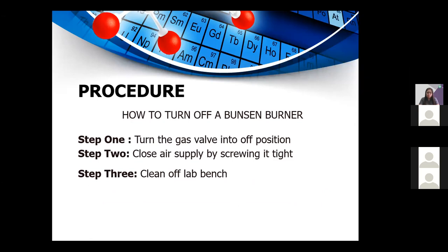How to turn off a Bunsen burner: Step one, turn the gas valve to the off position. Step two, close the air supply by screwing it in. Step three, clean off the lab bench. Always remember, when you are done using the Bunsen burner, clean the area where you used it to prevent any fire incidents or other hazards inside the lab.